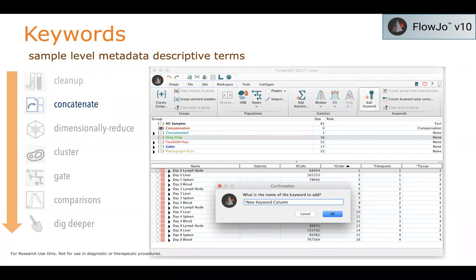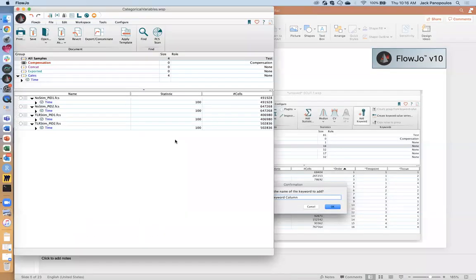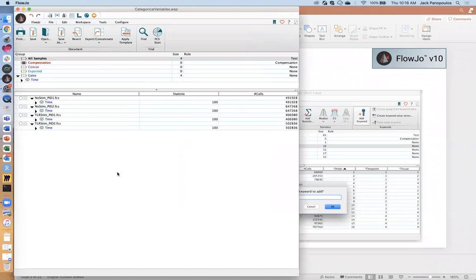Let's just go ahead and see how all of this works in FlowJo, and then how we can use it to our advantage when we're trying to use these high dimensional tools. Okay, so I'm going to exit out of the slideshow, and then we're going to come right here into FlowJo. Now, the example that I'm going to give you guys today is fairly simple. Okay? I didn't want to get it too complicated. Don't want to throw you for anything. I think it's a very elegant data set for this purpose.